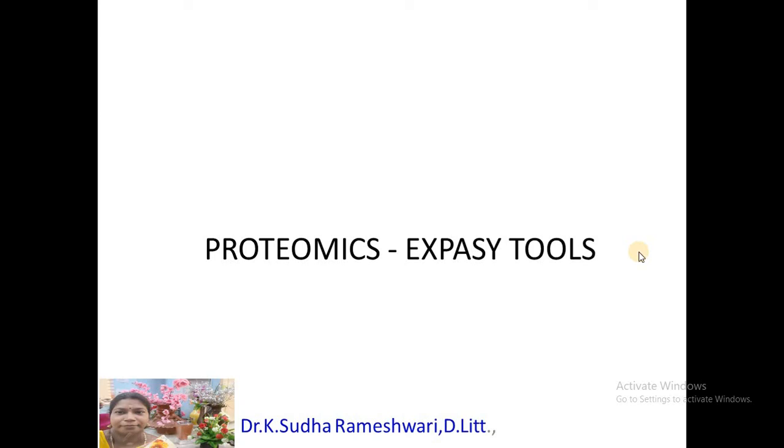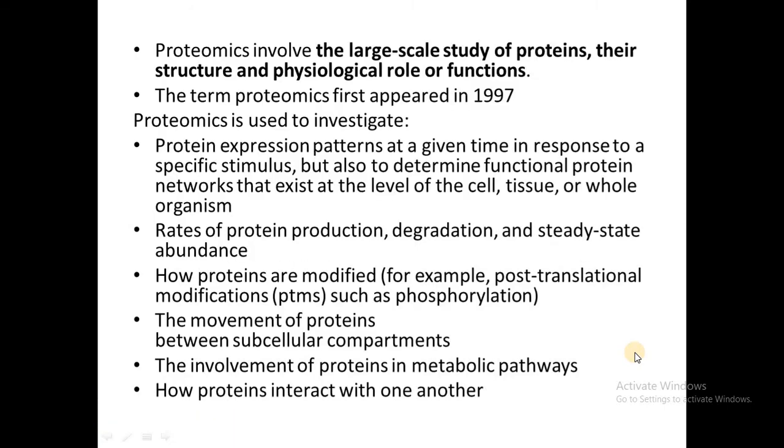Hi, today in this video we will see about proteomics using Expasy tools. What is proteomics? Proteomics is the large-scale study of proteins and their structure, physiological role, and functions. So we will study the proteins by using Expasy tools.